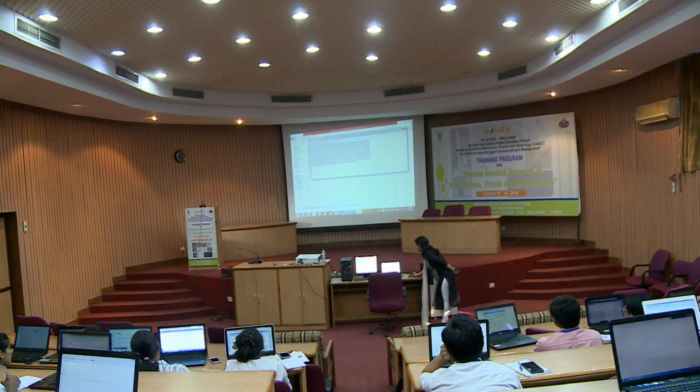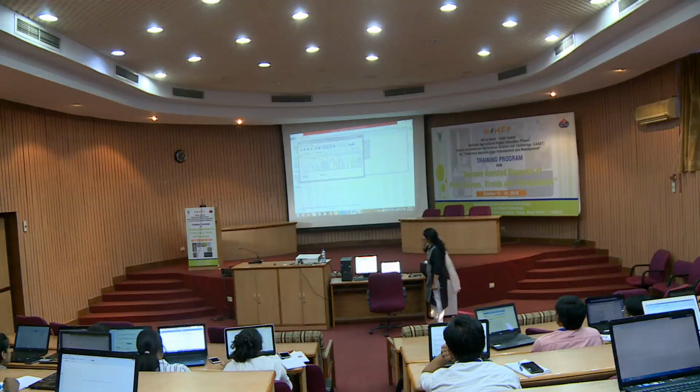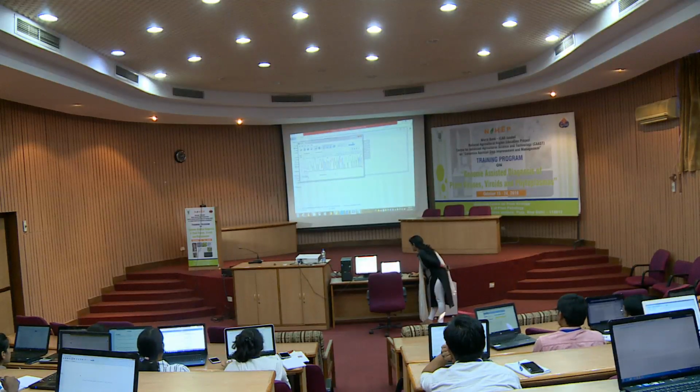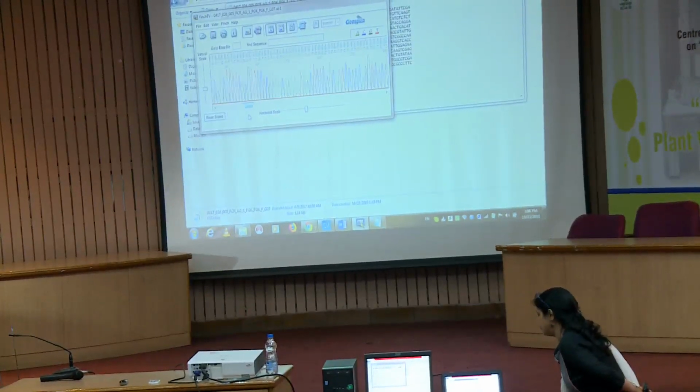So, the Finch TV file which I just showed you, this is Finch TV. This is the chromatogram file of each and every base of your sequence, correct. So, if you just scroll down a little bit, you will get the whole sequence.